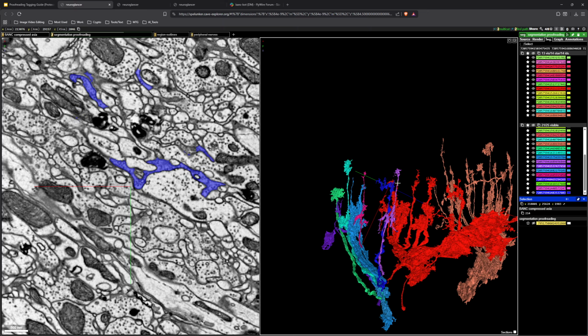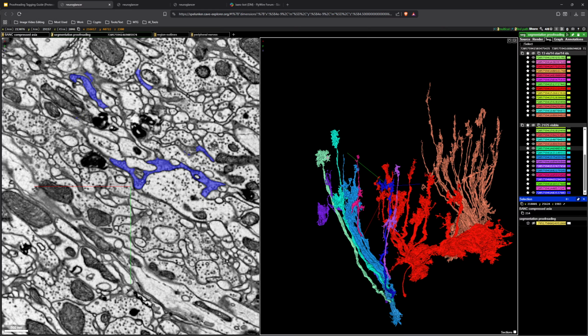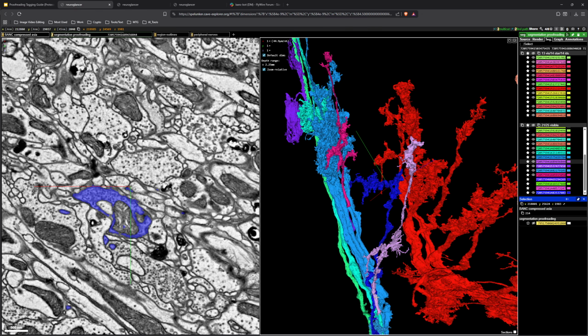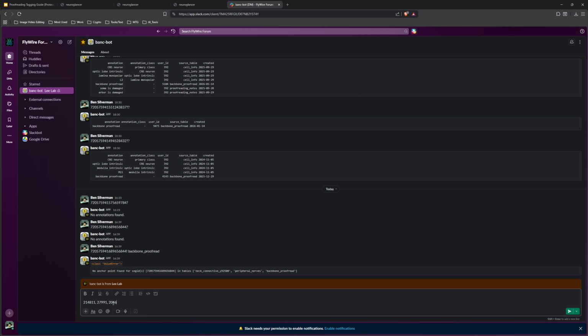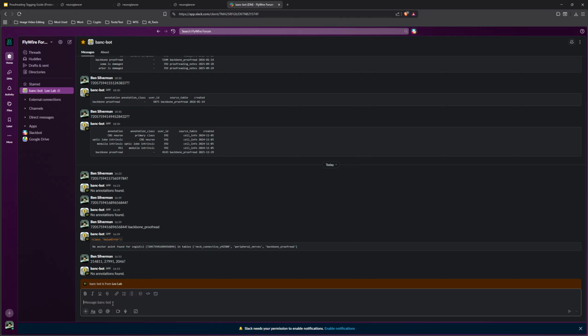these all line up in the same region, so we can assume that it probably doesn't keep going, unlike this cell type or that cell type. So this is probably pretty good, just overall morphology. So with that assessment, we're going to take the coordinates here, and we're going to go to banc-bot and just ask banc-bot real quick, does the segment here with these coordinates have a proofreading tag? It does not.